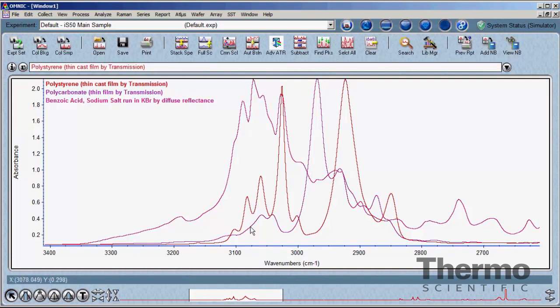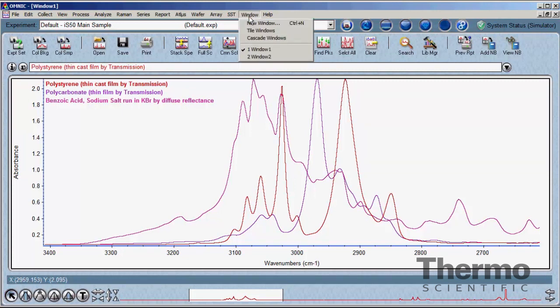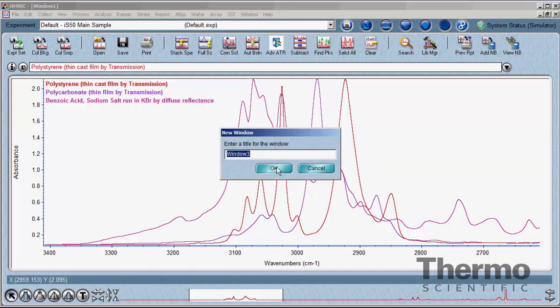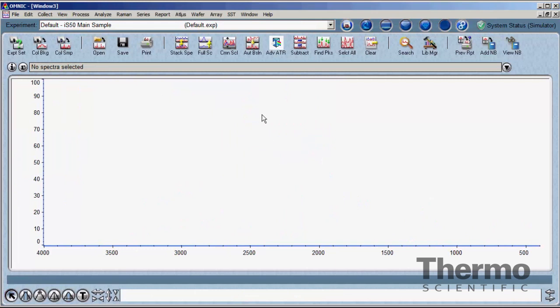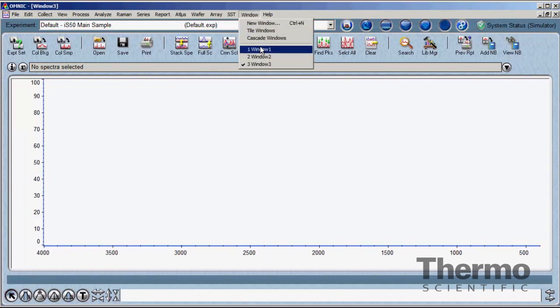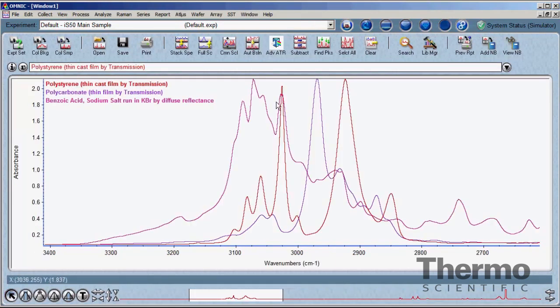The number of spectra in the window is limited only by the available memory in the computer. Multiple windows, each containing multiple spectra, can be created on the Window menu. Similarly, the number of spectral windows open is also dependent upon available computer memory.